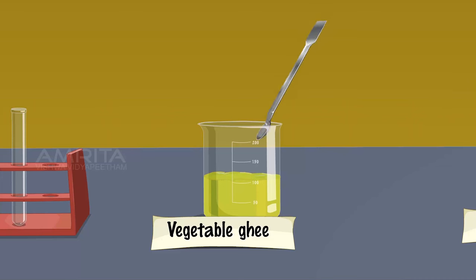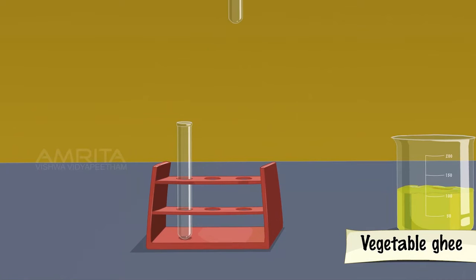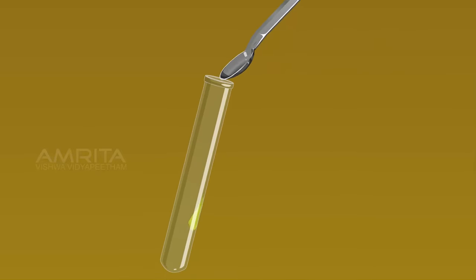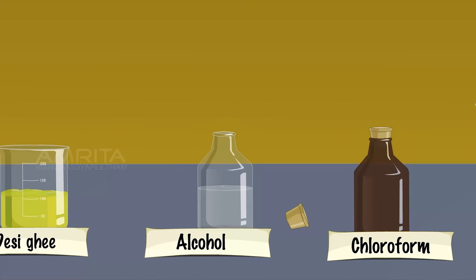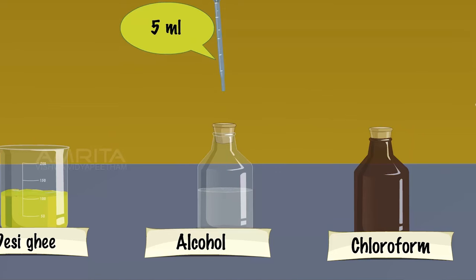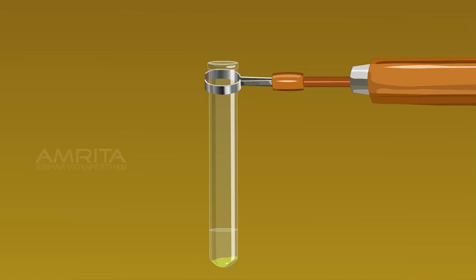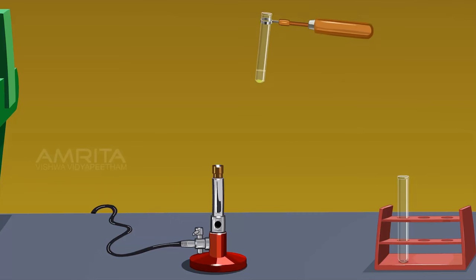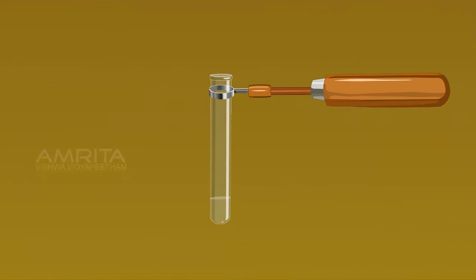Vegetable ghee forms a lower layer. Take a small amount of vegetable ghee in another test tube. Using another dropper, take about 5 ml of alcohol and add it into the test tube containing vegetable ghee. Vegetable ghee forms a lower layer. Hold the test tube with the test tube holder and heat it over the Bunsen burner. The lower layer of ghee dissolves on heating.